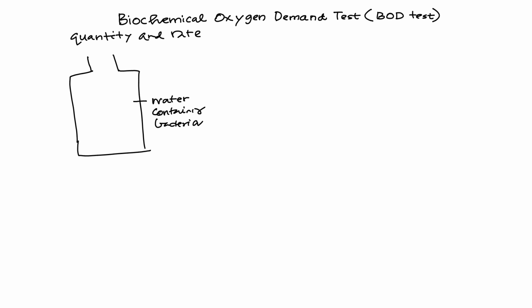Then we aerate. So you have water here with your oxygen. We aerate. Now you can imagine after aeration we have saturated dissolved oxygen.